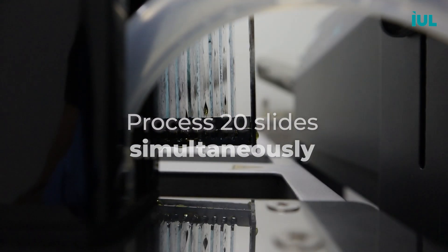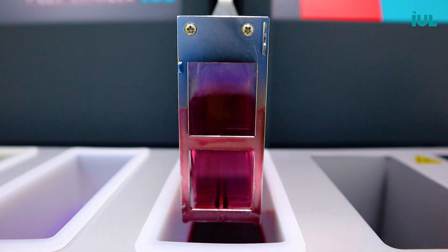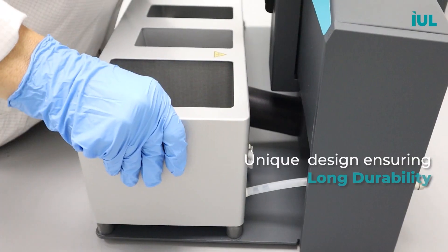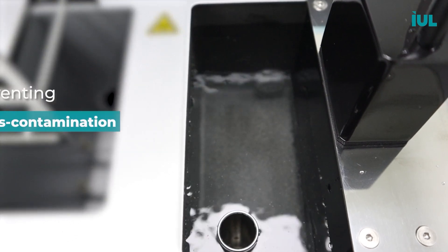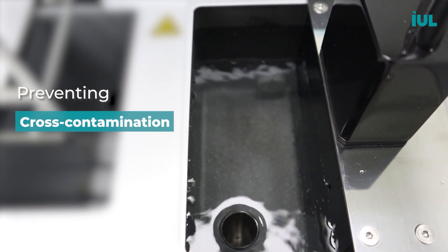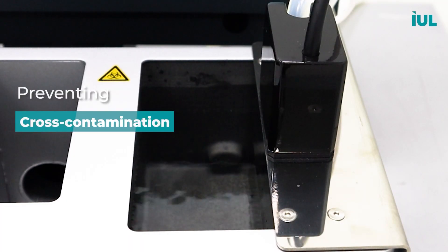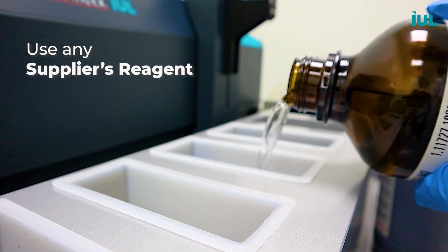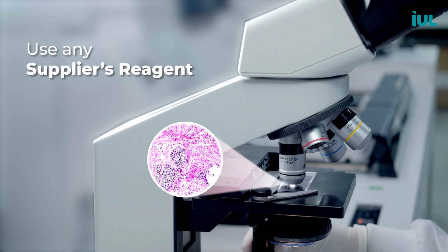Ensuring efficiency without compromising quality, the Polystainer accelerates stain preparation by efficiently drying out slides. This unique design ensures durability and longevity by keeping highly oxidative reagents away from sensitive components. The Polystainer keeps the rinse water clean so you can focus on accurate results.